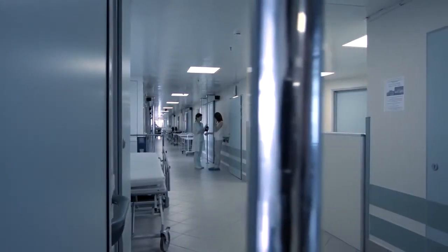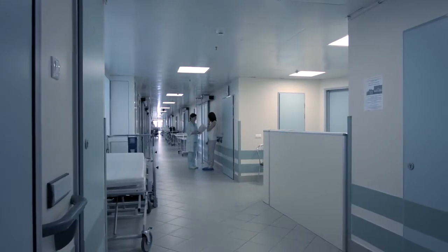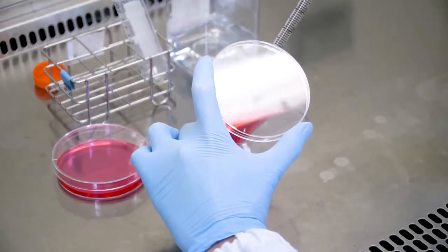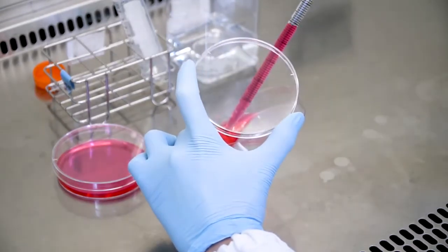Stem cell therapies, however, require enormous amounts of cells. Current cell culture techniques are prohibitively expensive and are unable to produce sufficient numbers of cells within a short time frame.